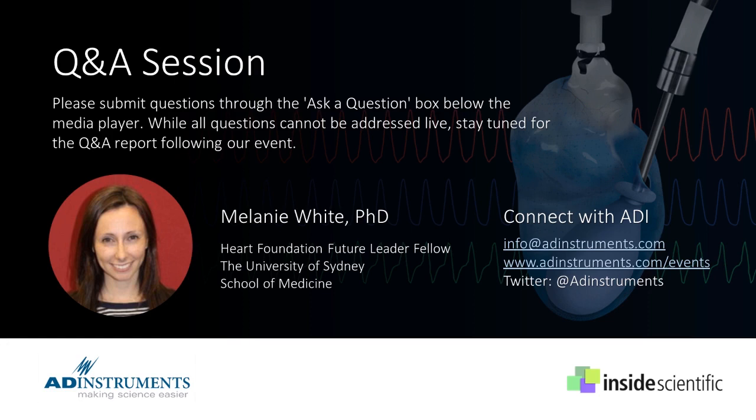Now, Melanie, I know you talked a bit about this during your presentation, but maybe you could just elaborate. The question is, do you have any advice on defining exclusion criteria? And what are the right parameters to be included in a protocol of ischemia reperfusion for a Langendorff experiment? Yeah, we definitely have minimum parameters, but it's also important to consider maximum parameters. And we saw this for a small period in our group as well.